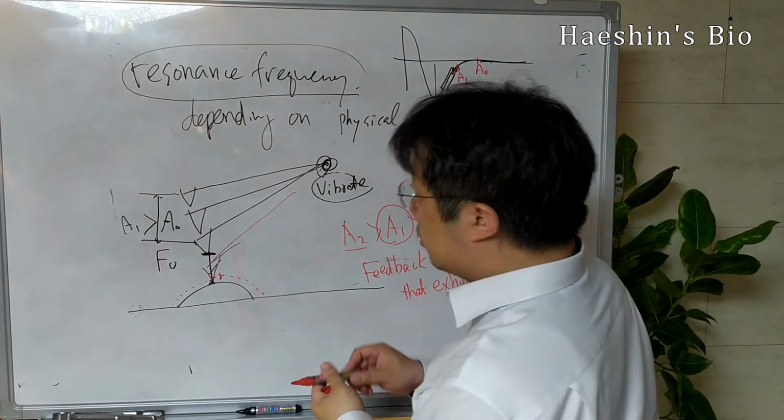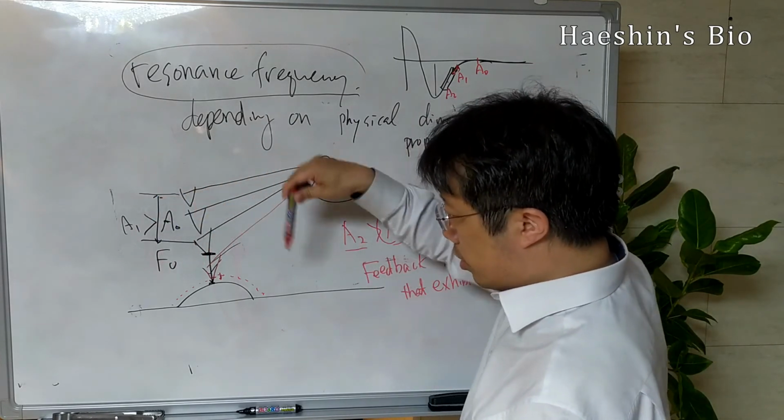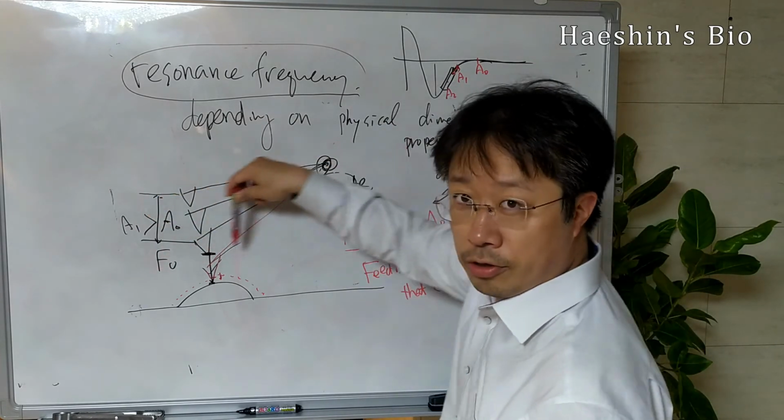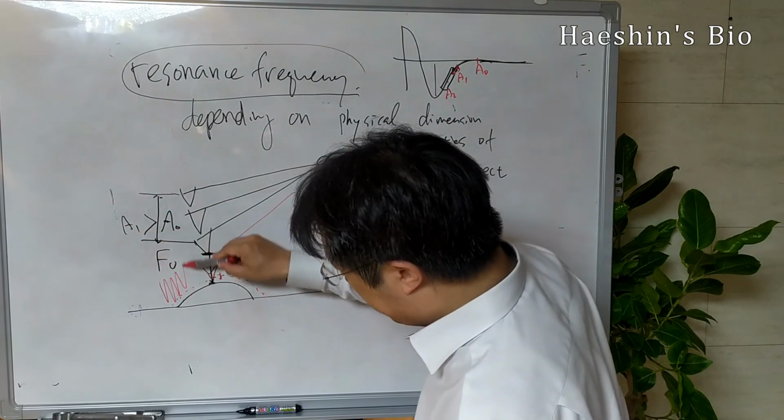In other words, this is basically scanning probe microscopy. The probe is vibrating and, at the same time, scanning across the surface. In this situation you can be vibrating here now.